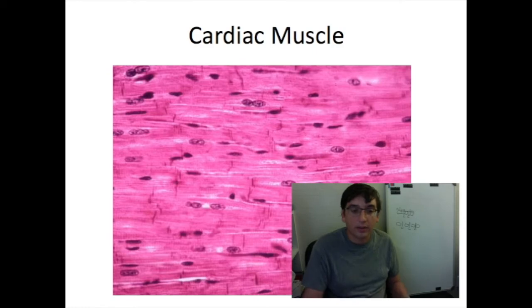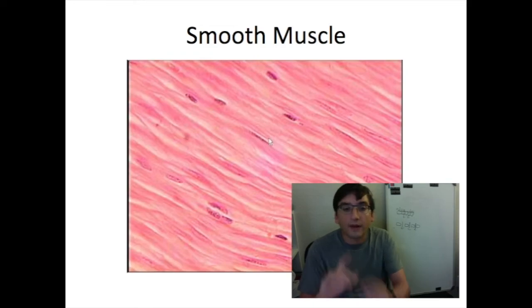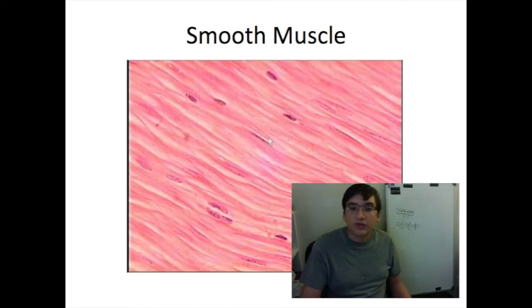so that you can control how much force your muscles are pulling with. Smooth muscle is distinctive for not having any striations. It's the only unstriated muscle that we cover. Now, it still has those fibers that shorten, but instead of being arranged in a straight line, they're wrapped around the outside. Smooth muscle can easily be mistaken for a dense, regular fibrous connective tissue, sometimes mistaken for nervous tissue or epithelial tissue. Note that it's not any of those.